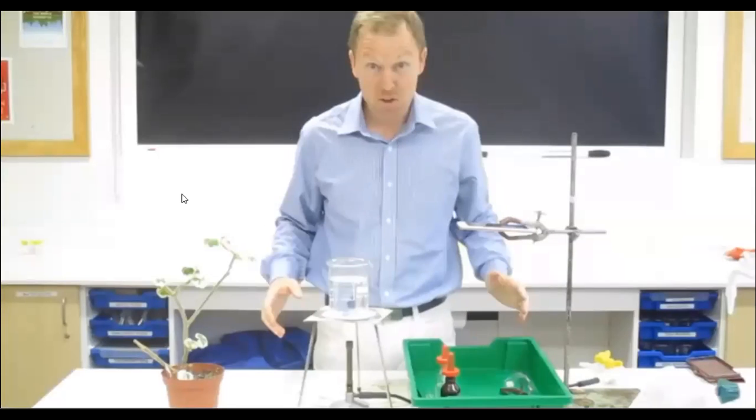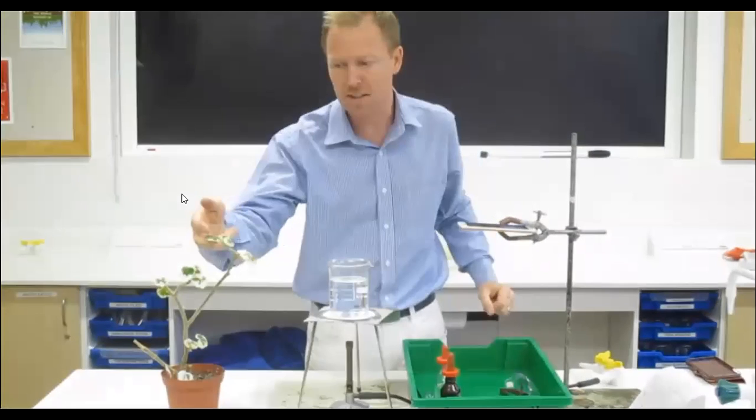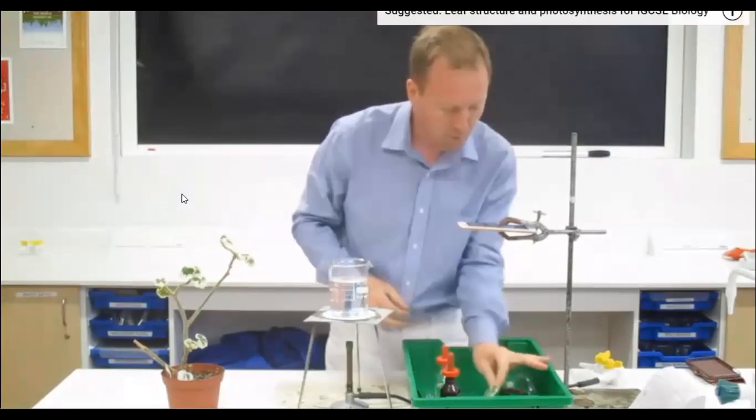Hi, today what we're doing is we are testing a leaf for starch. We're testing a variegated leaf, and that is one which has chlorophyll in some bits and not in other bits. I'll just put it there so you can see.